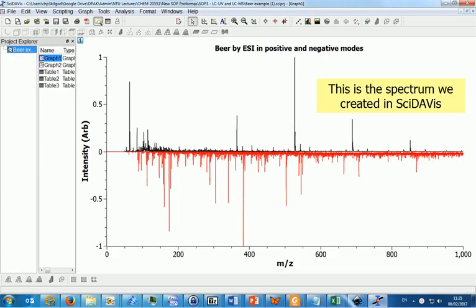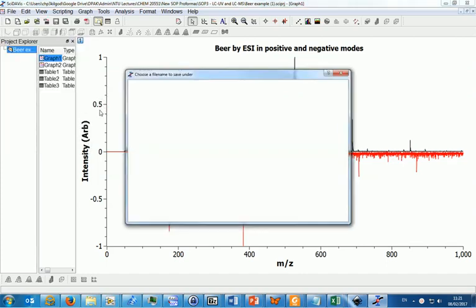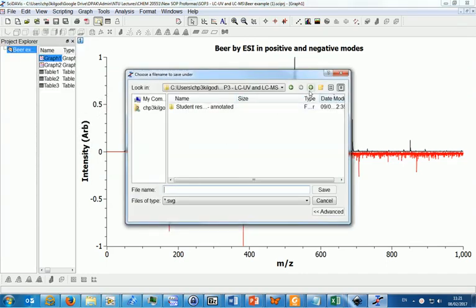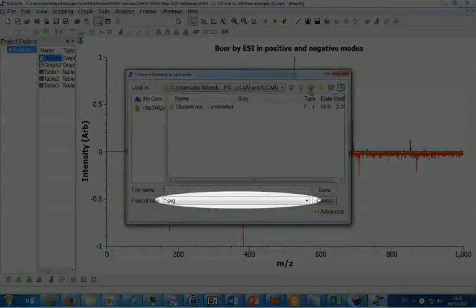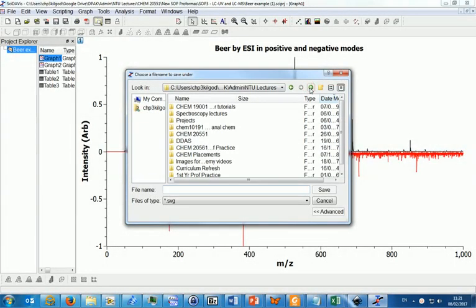So here is a spectrum in SciDAVis similar to the one you will have created from your beer data. To export the spectrum, go to the file menu and select export graph like you can see here. Make sure to save the file as an SVG file, that stands for support vector graphics. Make sure to save the file with a sensible name to a sensible location so you can find it later.